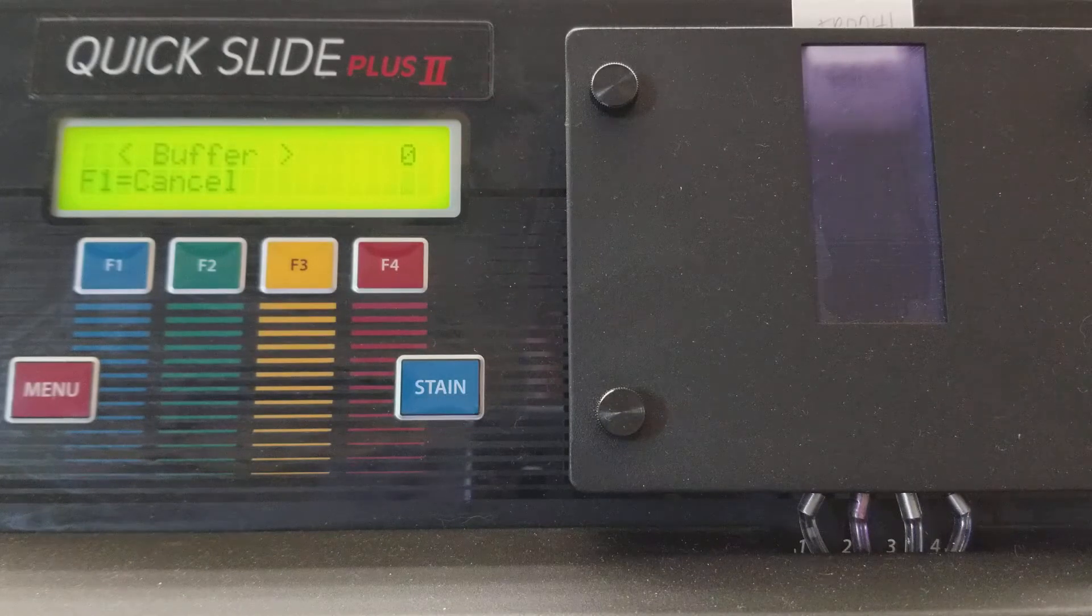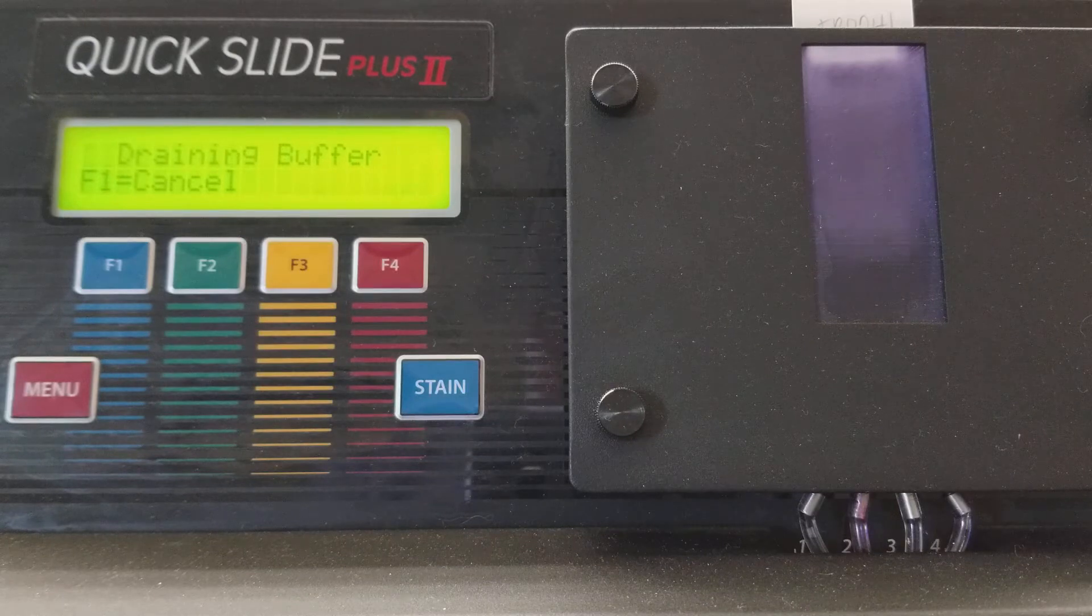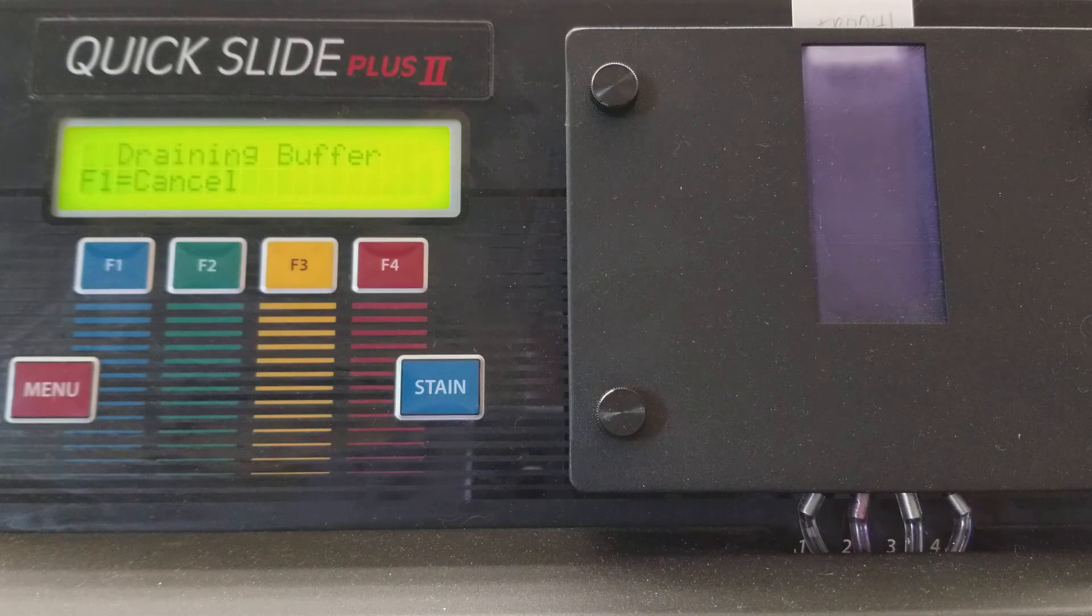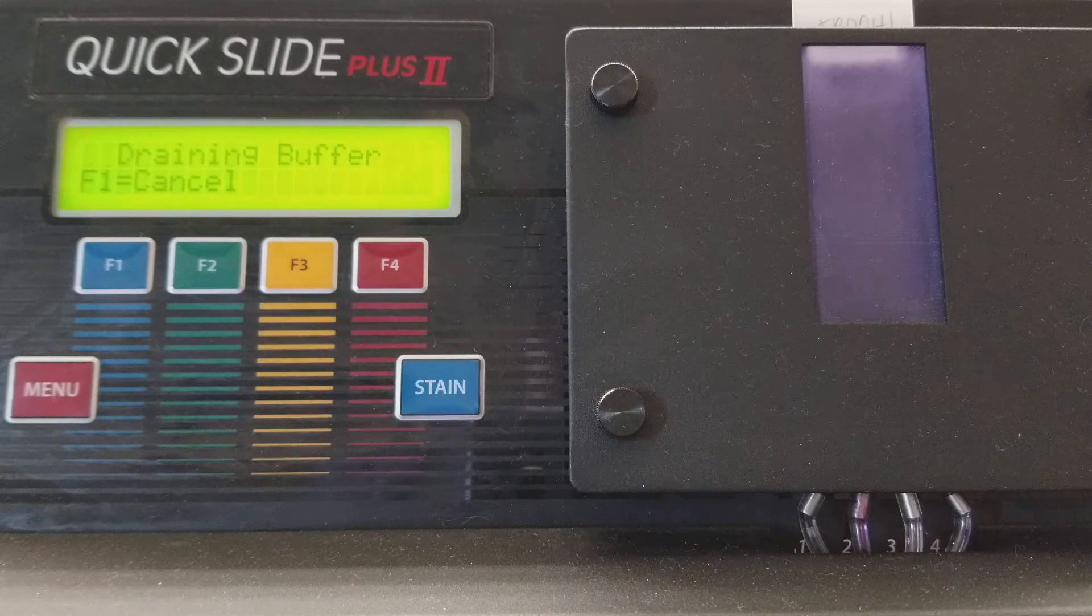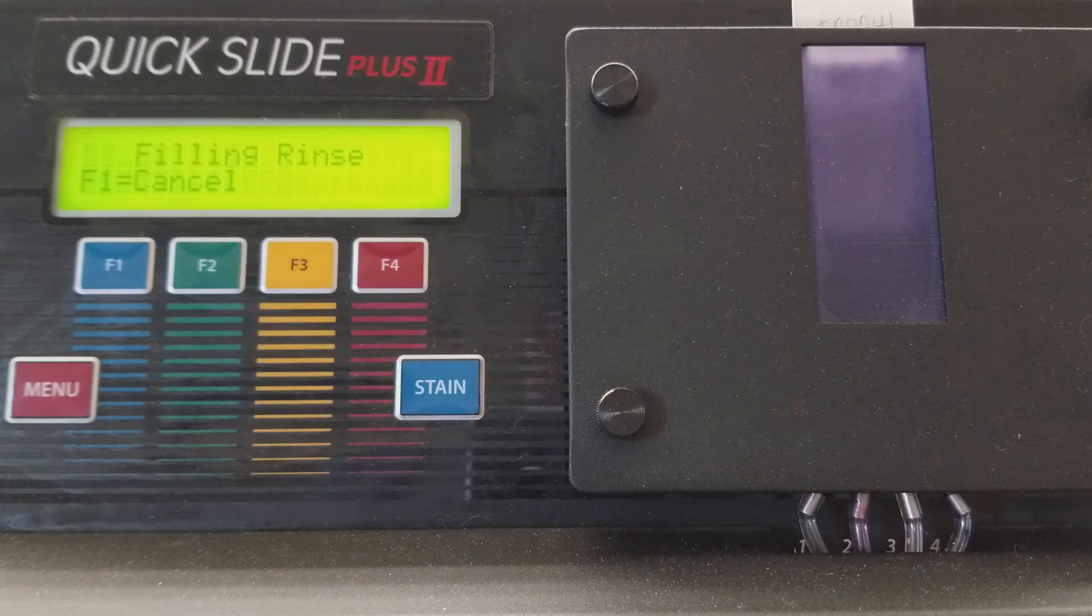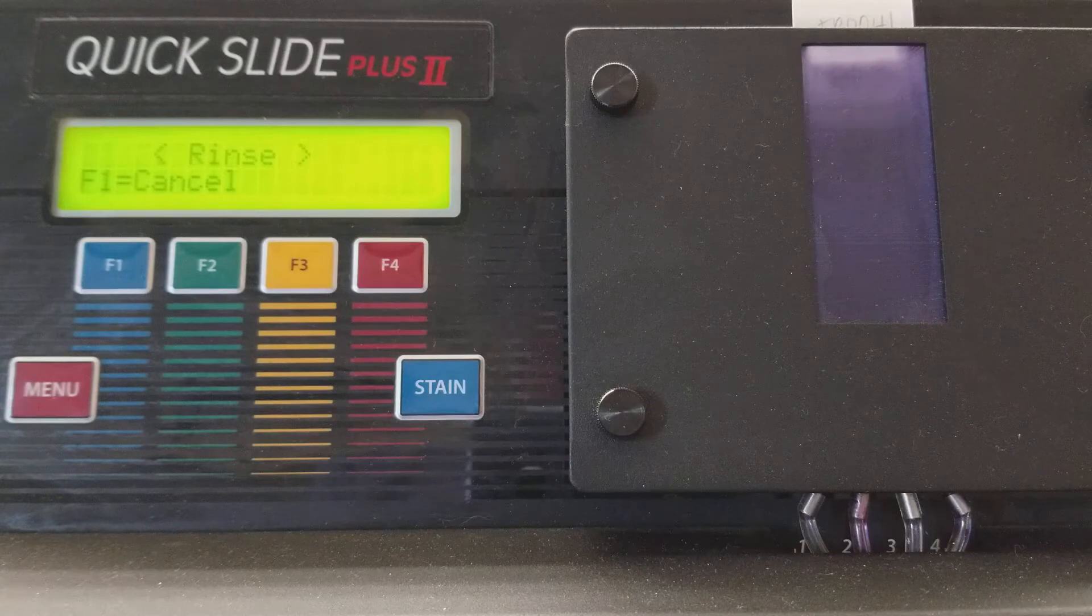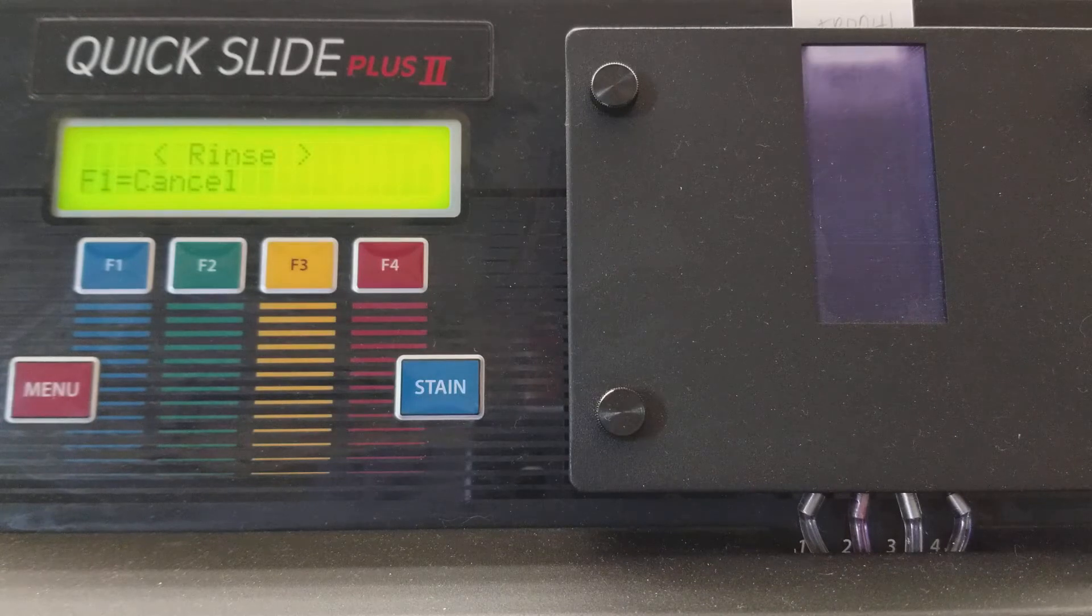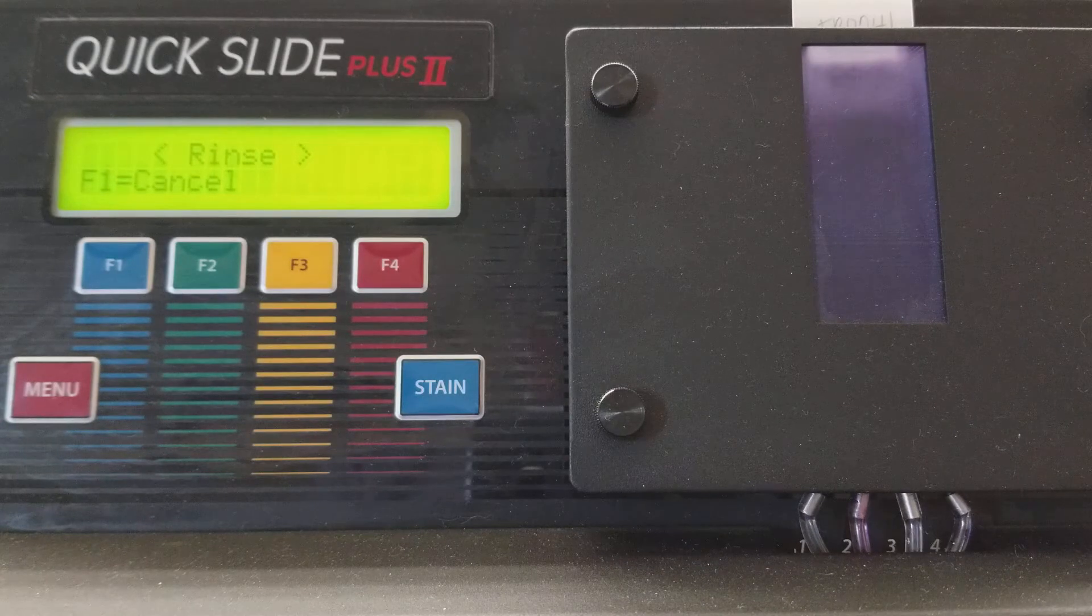Swishing it around a little bit and now it's going to drain. Now we're going to be doing the rinse step and then after that it should be done.